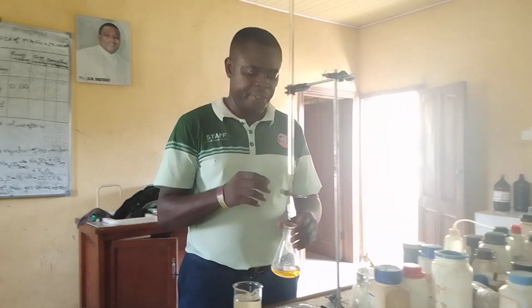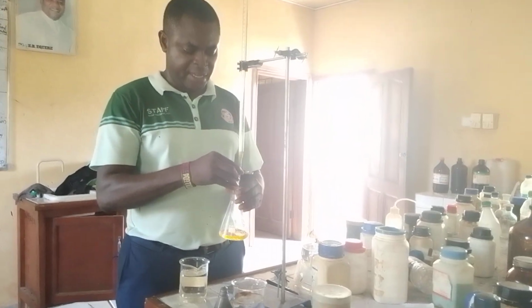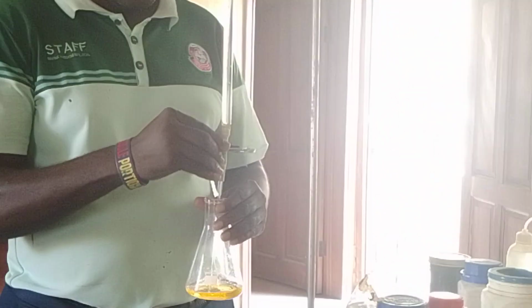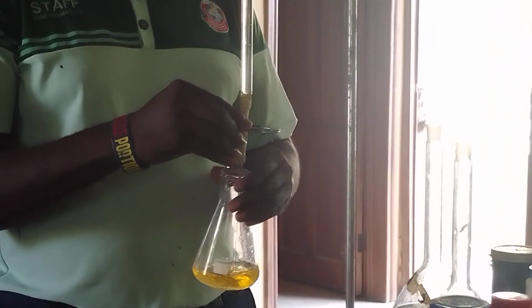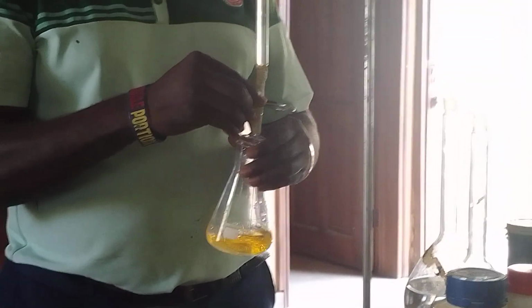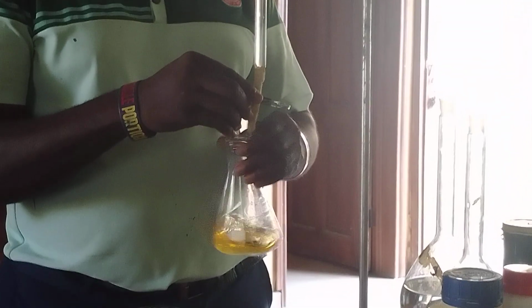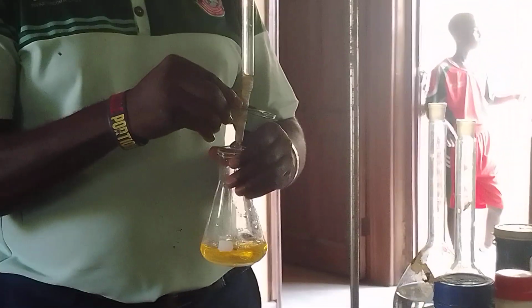So I want to titrate. Now, as I am dropping this acid inside here, I'll be shaking it until the color changes from yellow to pink. When it changes from yellow to pink, then I will stop the titration.